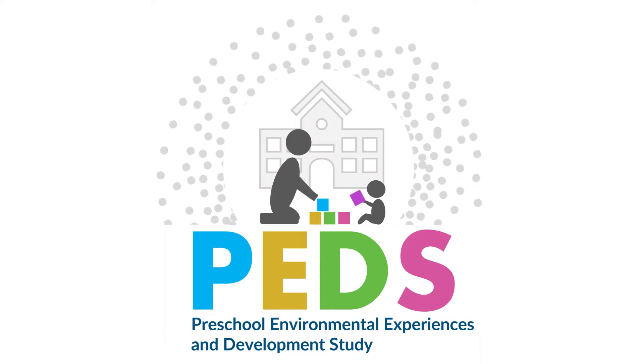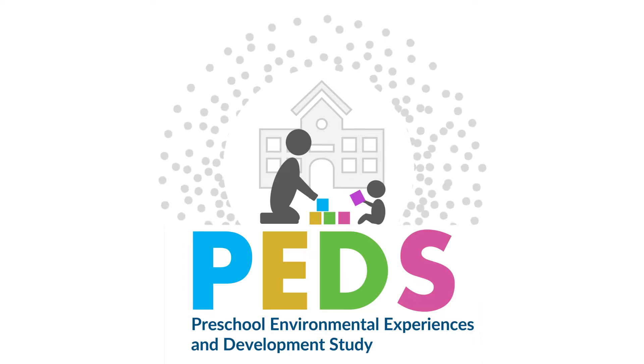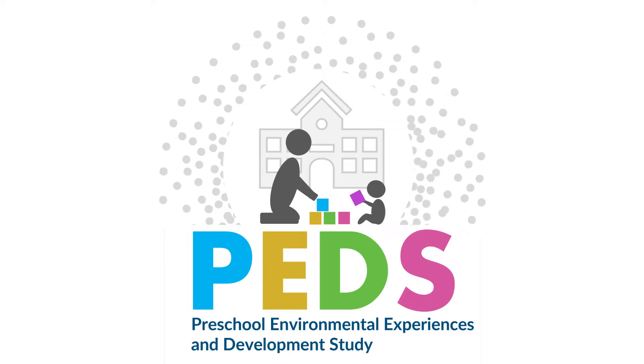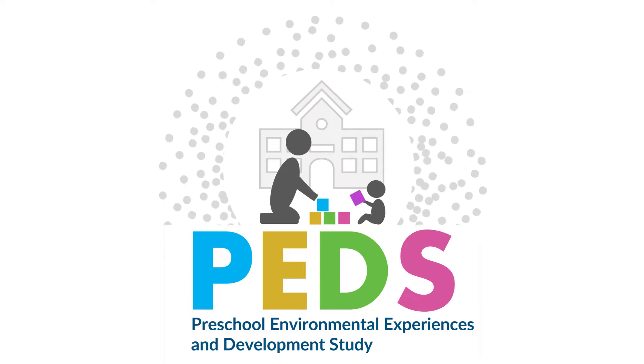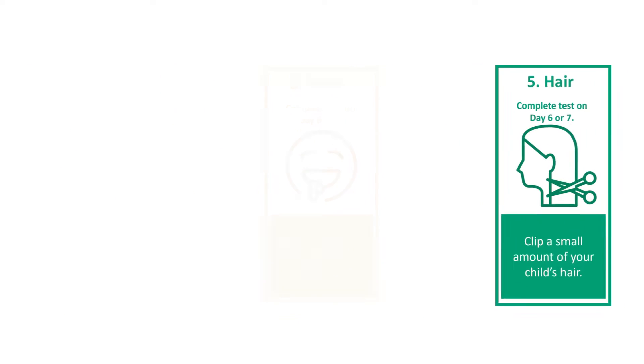This is a video from the Preschool Environmental Experiences and Development Study, or PEDS team, and today we're going to walk you through the five-step process for collecting your home samples. We will overview the process for collecting hair samples on day six or seven.